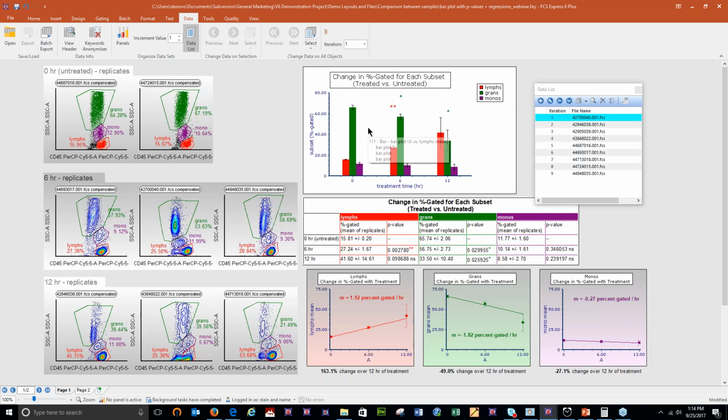Okay, because the bar plot and these regression plots down here are actually deriving those values from the plots themselves. So you could batch process through it if, let's say, rather than just 8 files, I had 16 files, and I'd want to batch through the next iteration of this group of 8 plots. Of course, you could batch process in that sense, but the comparisons you're making all have to be present as plots on the page, if that makes sense, okay?